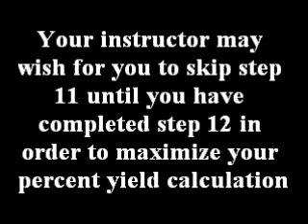Also, remove a few additional crystals to perform the starch test as described in Part C. Your instructor may wish that you complete Step 12 before moving on to Part B, the iron-3 chloride test, or Part C, the starch test, in order to maximize your percent yield. Both Part B and Part C will be described later in the video.